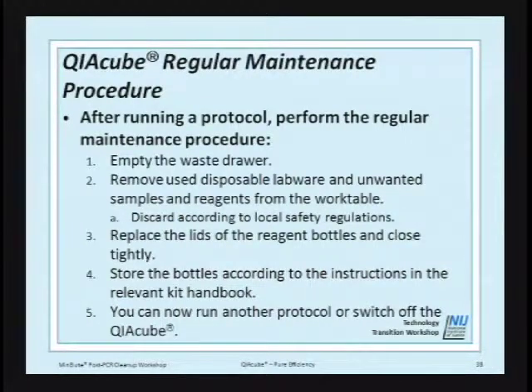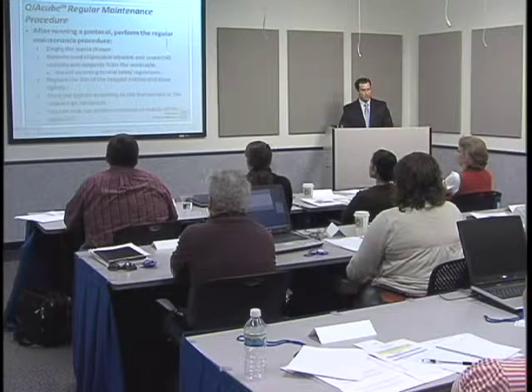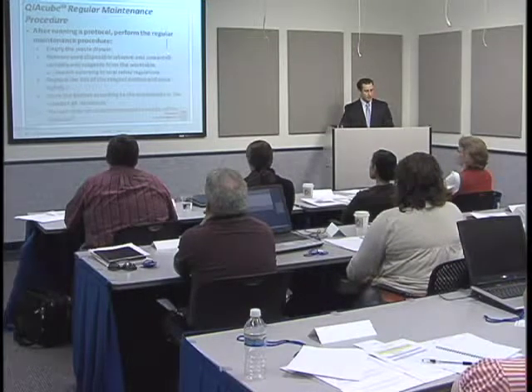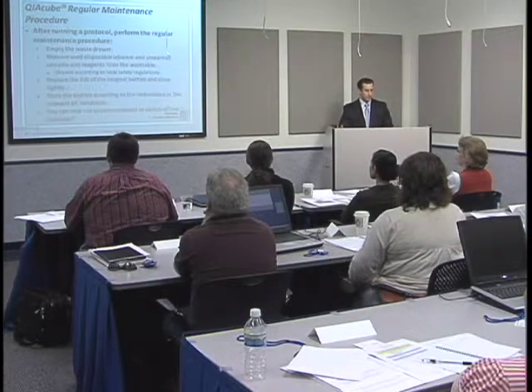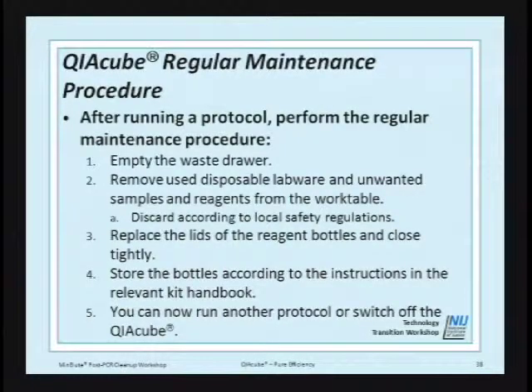I'm going to go into the maintenance of the QIAcube now. Really, the maintenance of the QIAcube is fairly minimal. After each run, you want to empty the waste drawer, remove any disposables that you don't need anymore, replace the lids, store the bottles according to the instructions on the kit, and you can either run another protocol or turn off the QIAcube.